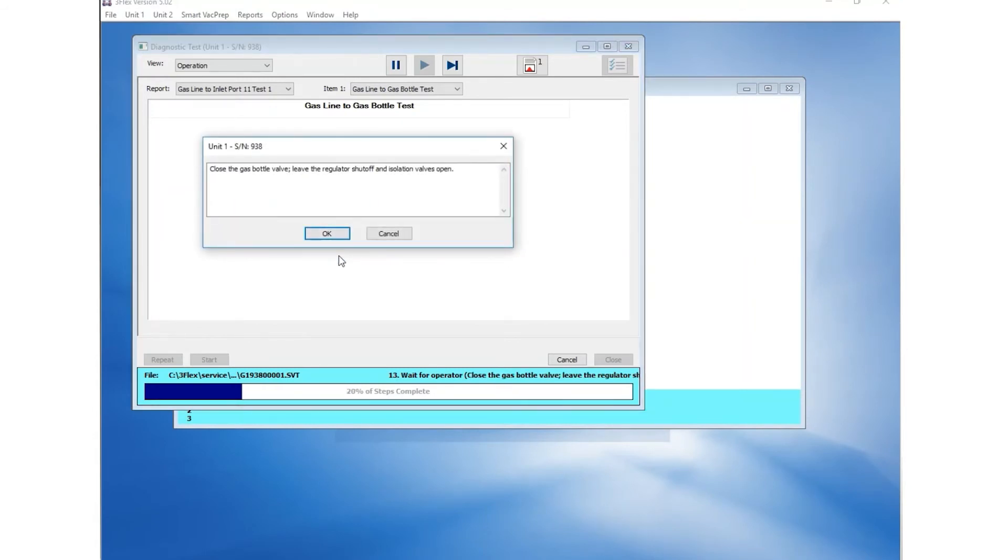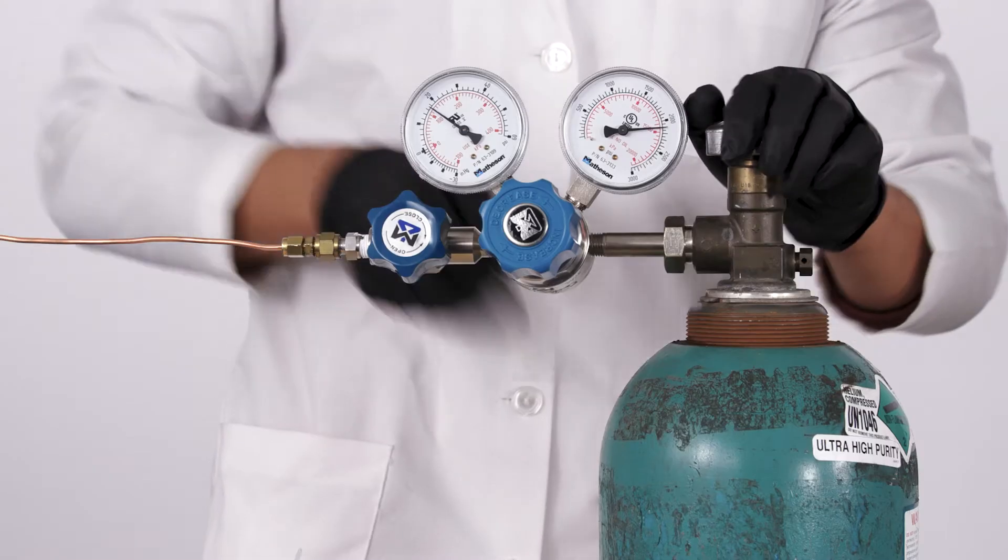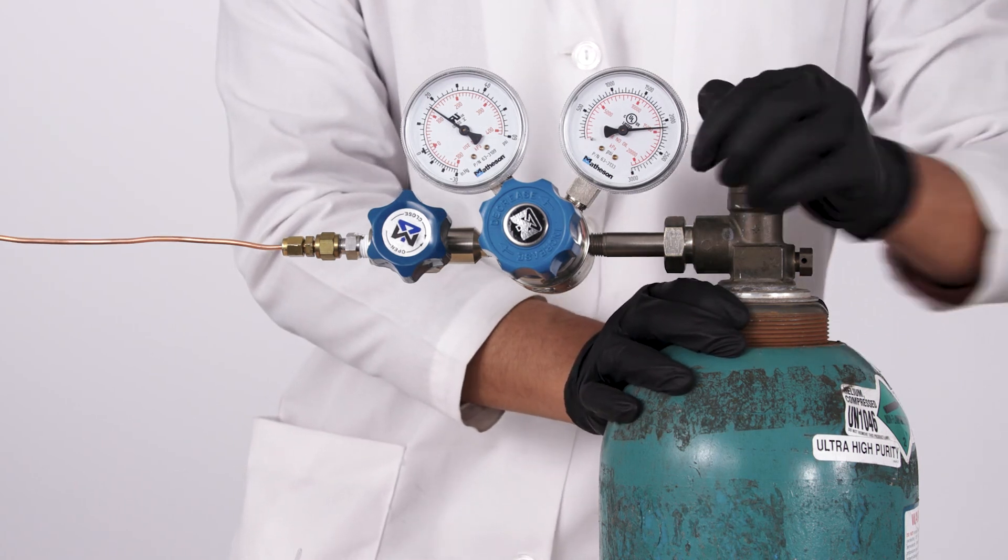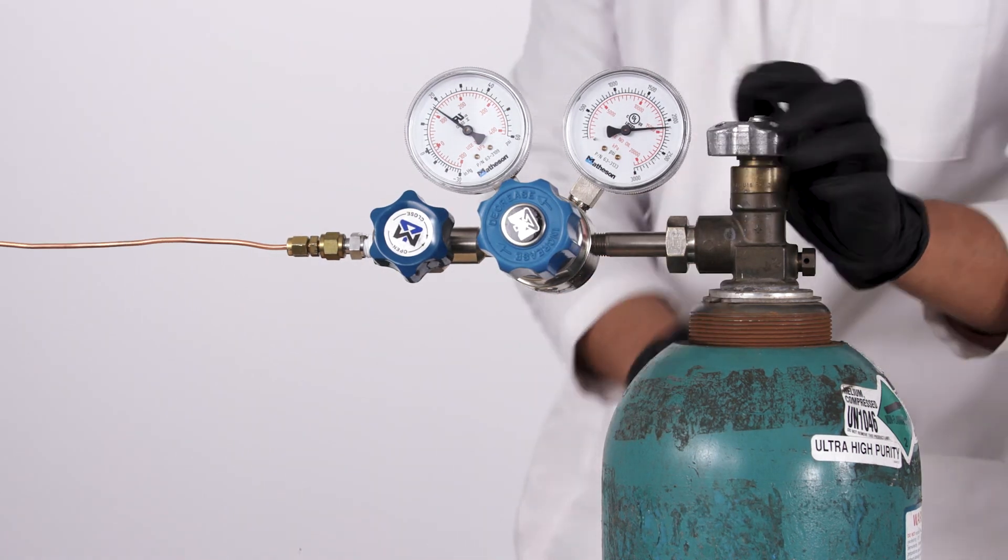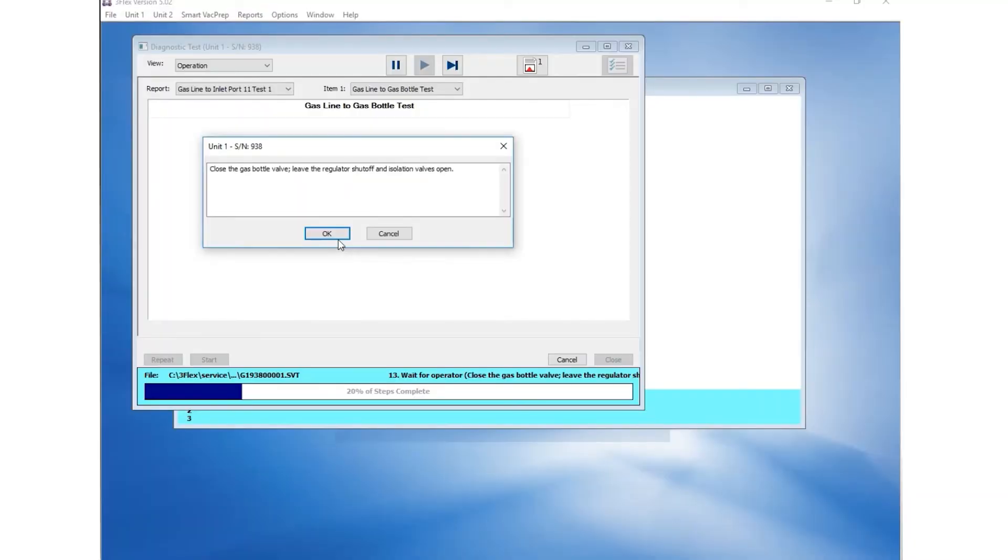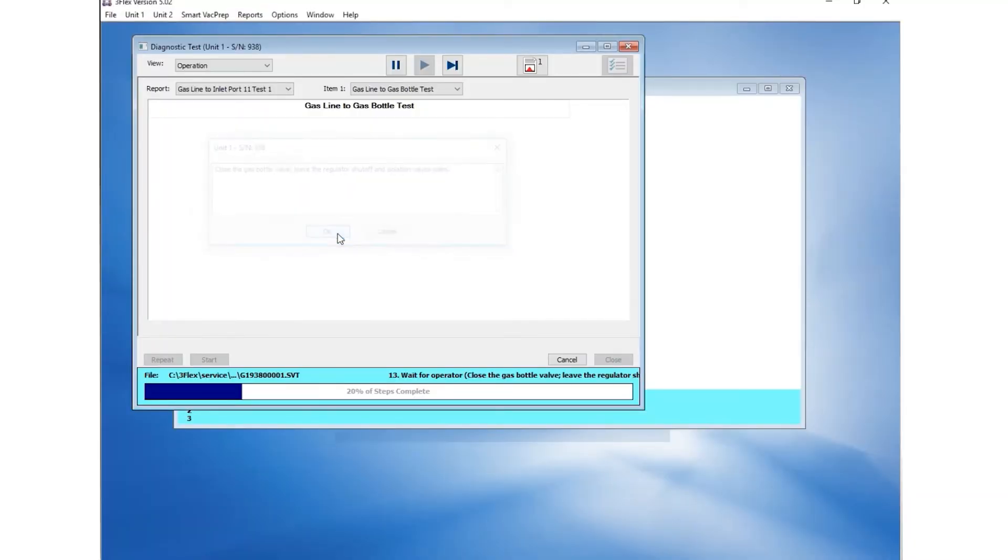For this prompt, check that the main gas cylinder shutoff valve is still closed and the regulator shutoff valve and isolation valve open. Click OK once this is verified.